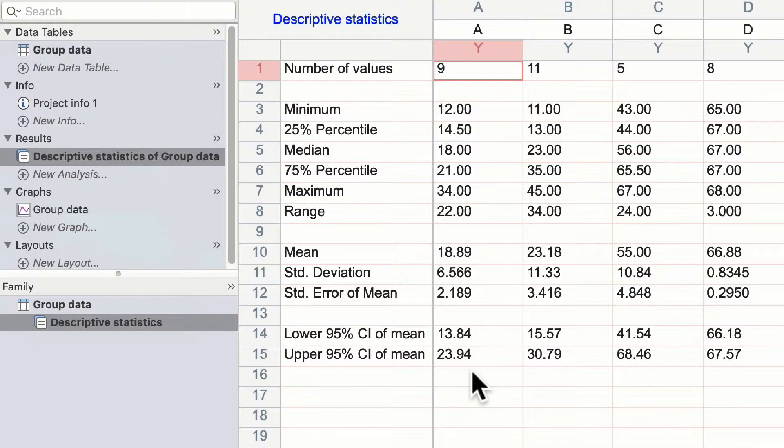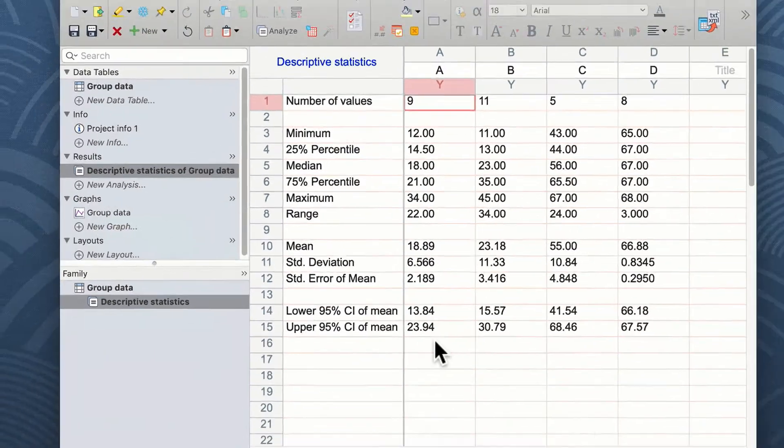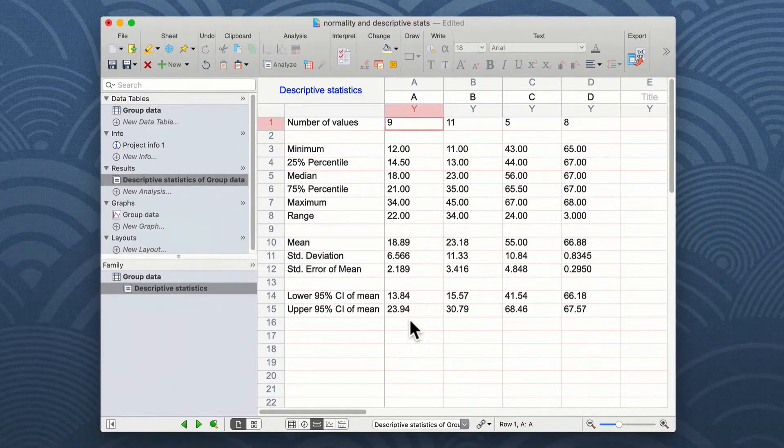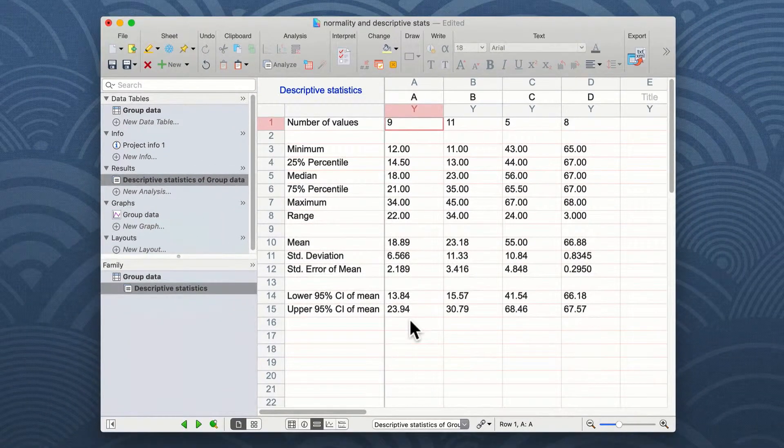It's easy to see the results of your descriptive statistics for creating tables or other figures outside of Prism.